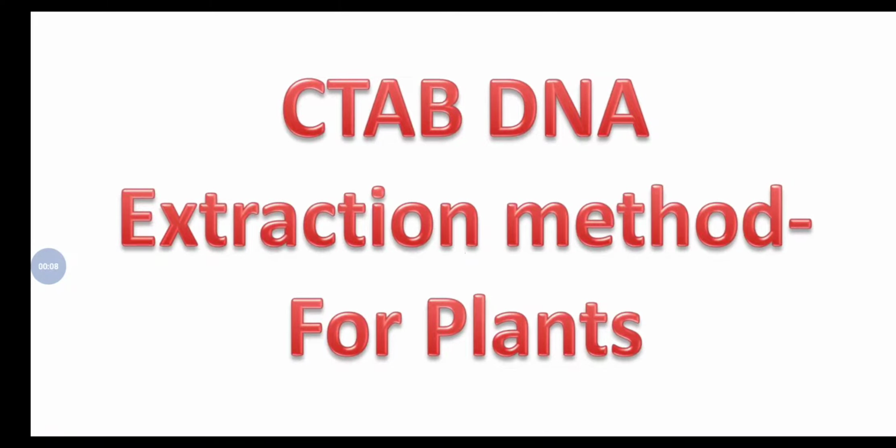So we were discussing the different types of DNA extraction methods utilized in laboratories for the isolation of DNA from bacterial cells, animal cells, viruses and plant cells. The first method we discussed was the phenol chloroform DNA extraction method, which is based on organic extraction. After that, we also discussed how we can precipitate the DNA and further quantify it.